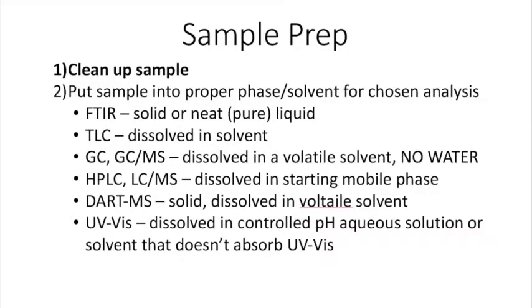So I'm going to give you a few general tips in this video about sample preparation. And let's start with what's the point of sample prep? Well, the big one is to clean up your sample. If it's messy like blood or urine or chocolate or something like that, there's too much stuff in there. You really need to focus down onto your specific sample. So the first thing you're trying to do is pull your stuff out, leave all the rest of the garbage in there.